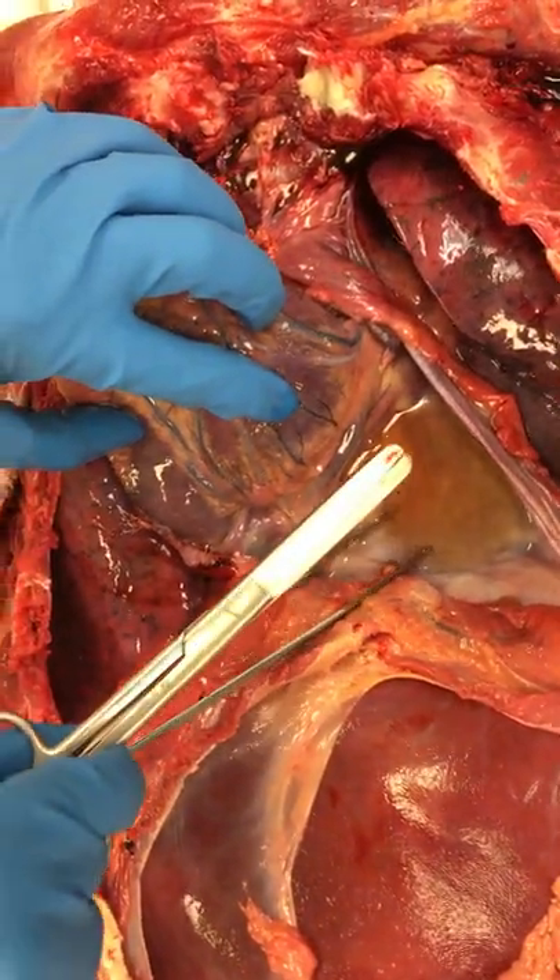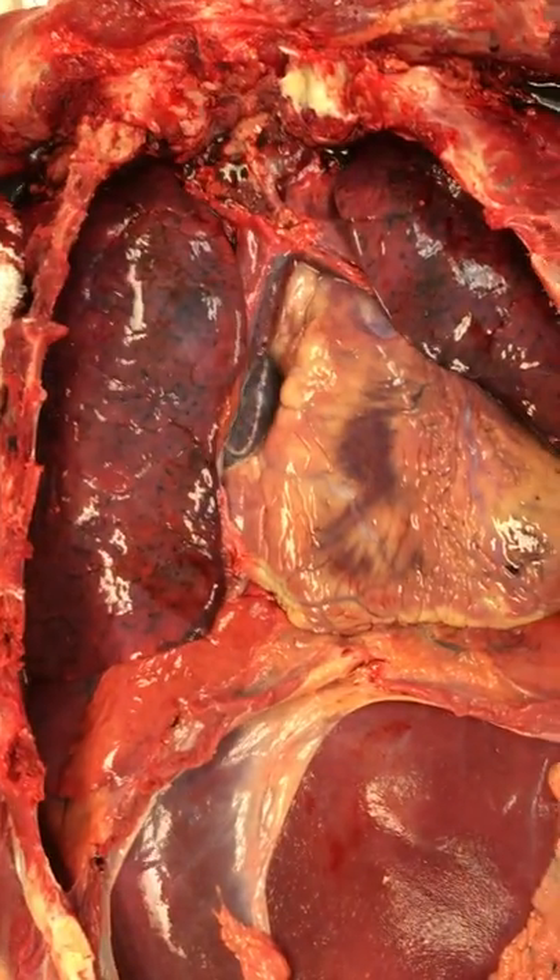There's a small amount of fluid here which is known as pericardial fluid, and that is the opening of the pericardium.